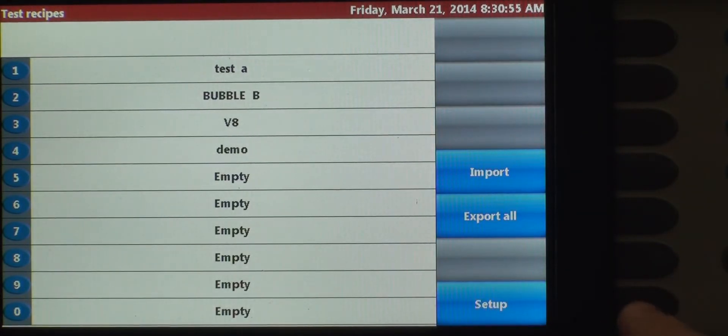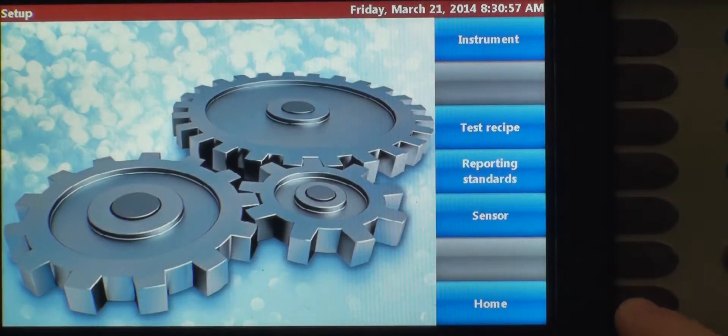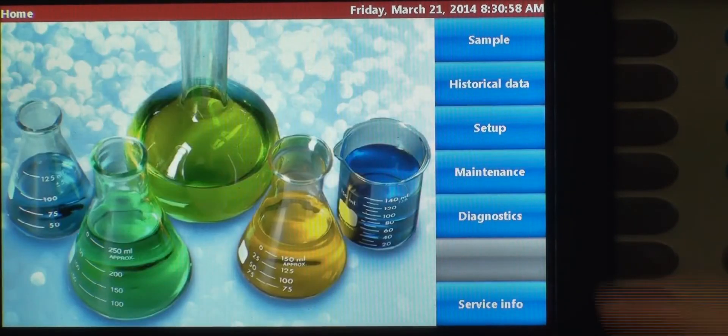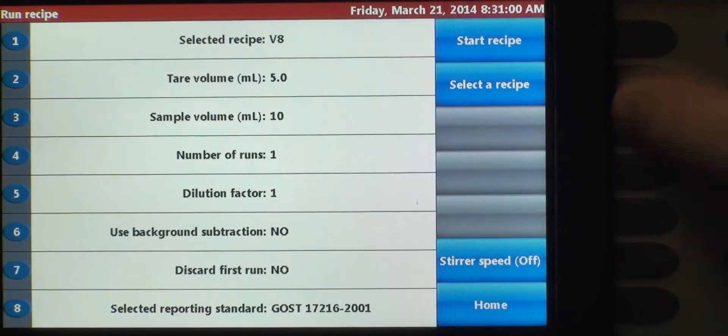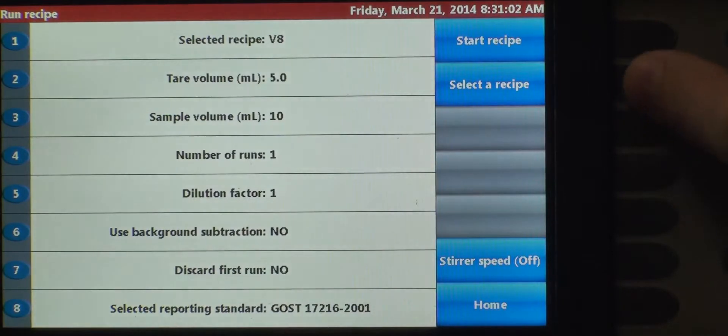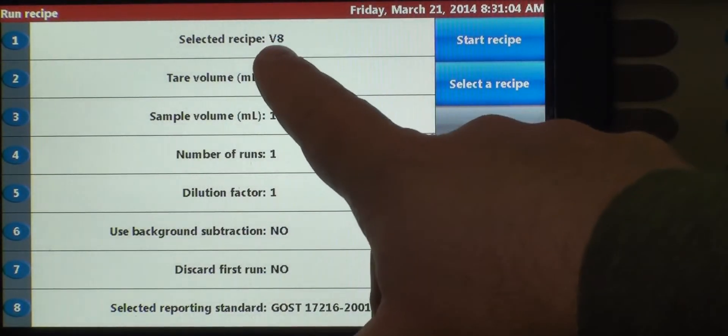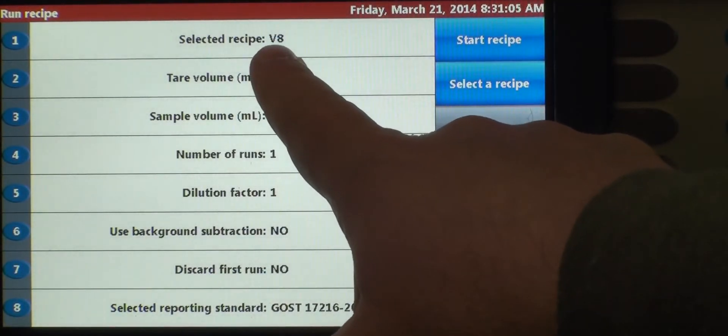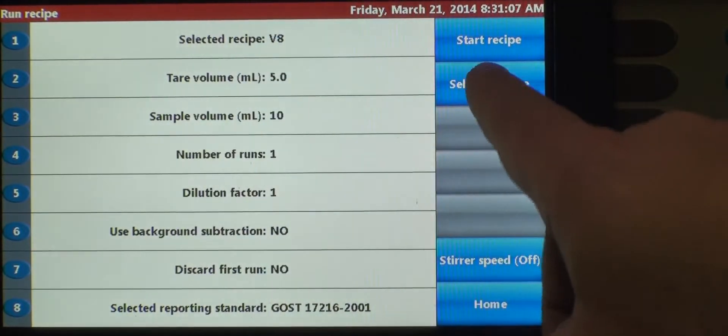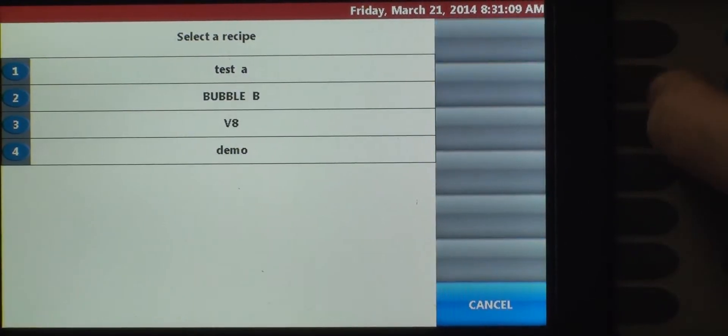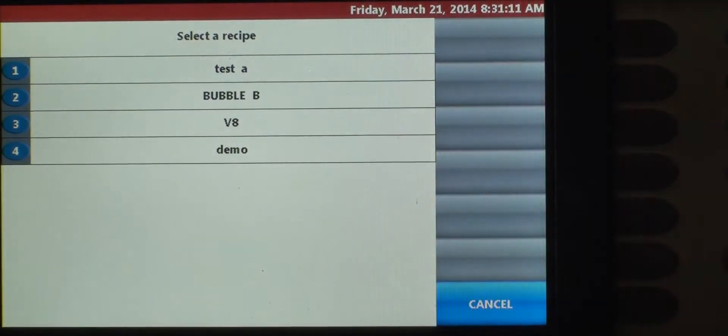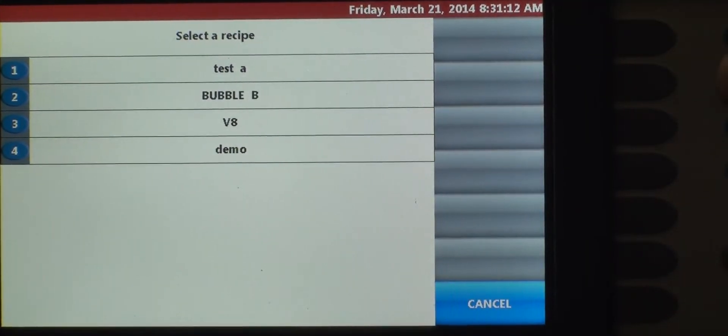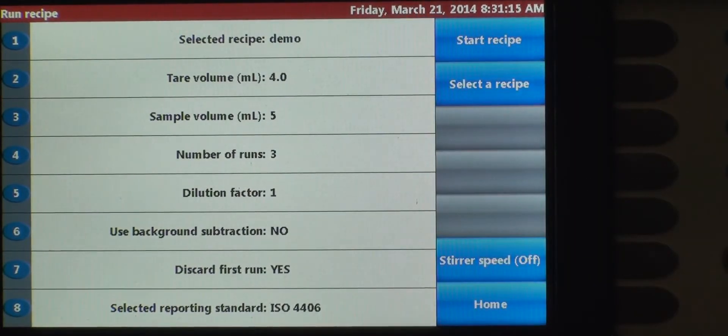Now when we go to the home screen, we want to run a sample. We can select a recipe. The current recipe that is on here right now is not the one we just created. So we want to select a recipe. There's our demo. And it pulls up everything that we just entered.